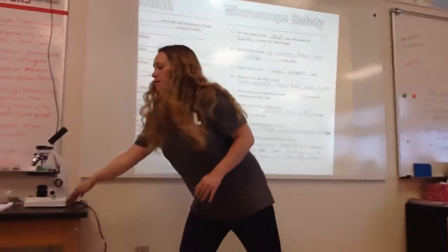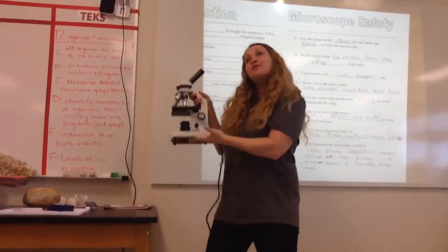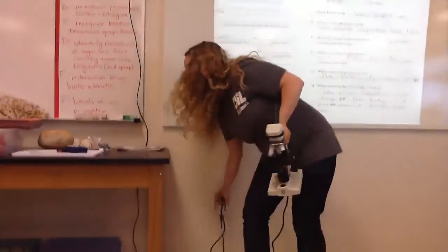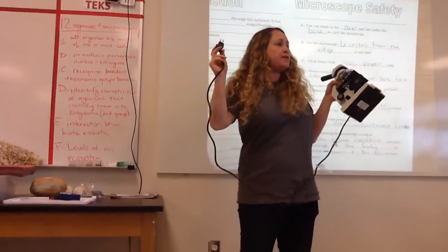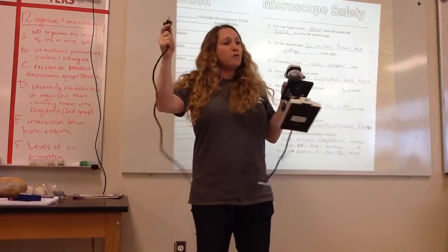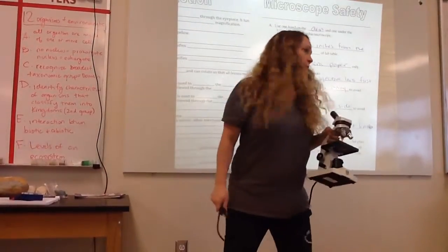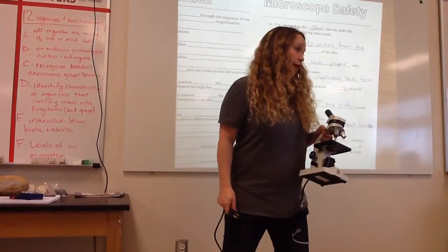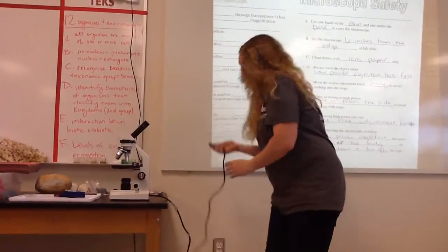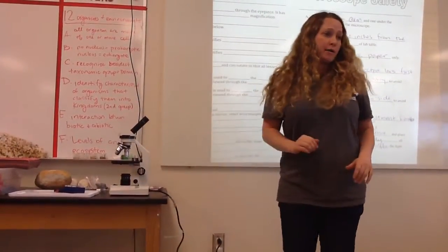So, this is a microscope. Your turn. It's amazing. Okay, so it has a plug. Some of them use batteries, and some of them use plugs. The one I'm holding today obviously uses a plug, so you have to watch out for the cord. It gets tangled on something, and then you walk away, boom! Something really expensive is going to fall on the ground, okay? So be very careful. So I'm going to go ahead and set it down, and I'm going to plug it in. It has an on-off switch, so it's not going to turn on automatically, okay?